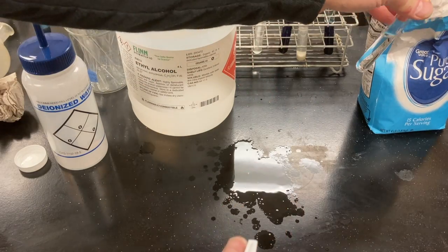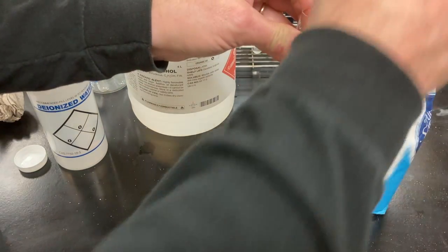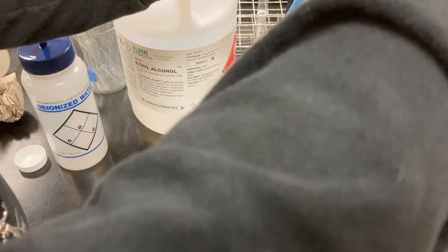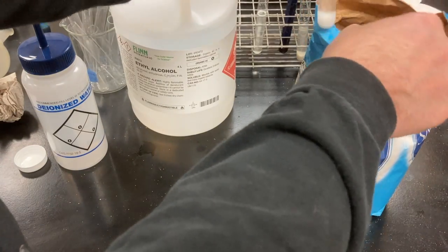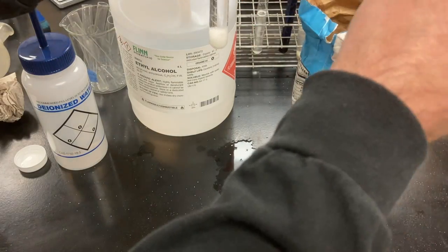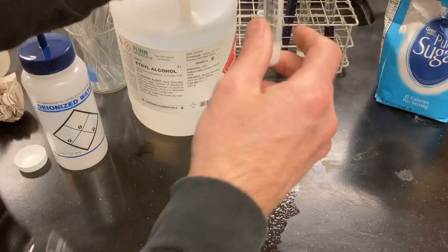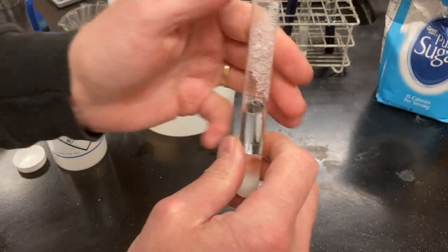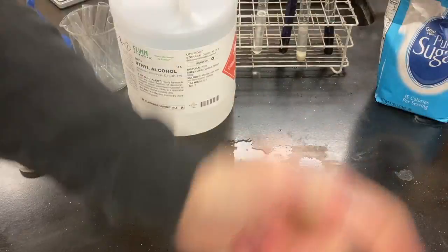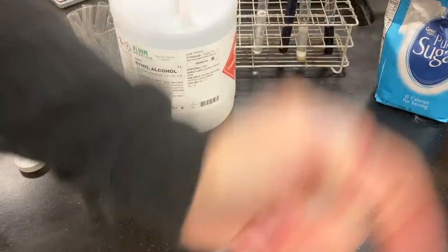Then I'm going to take some sugar and add that to the test tube and make a mixture of ethanol and sugar to see how that behaves. And again, I'm going to shake it up to give it a good chance to make a mixture, and I'll speed that process up because I shake it for quite a long time.